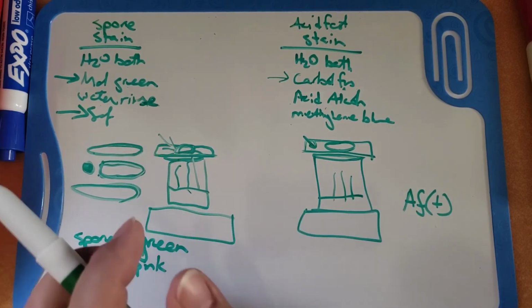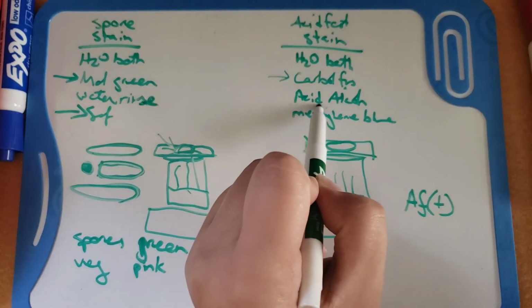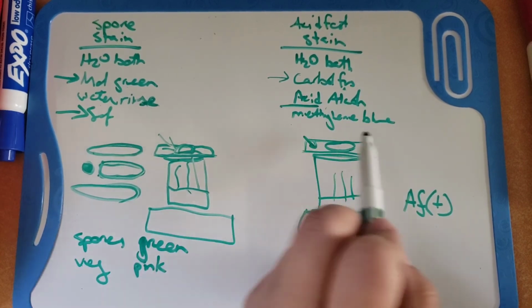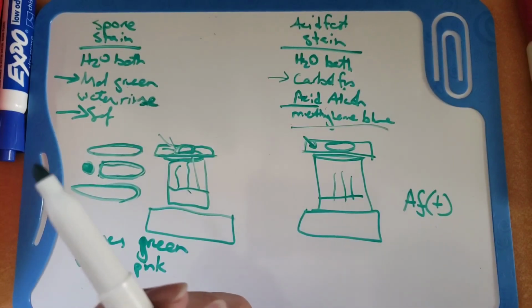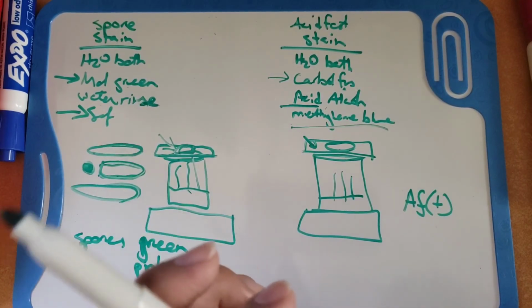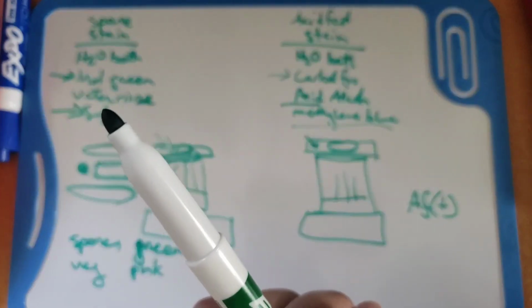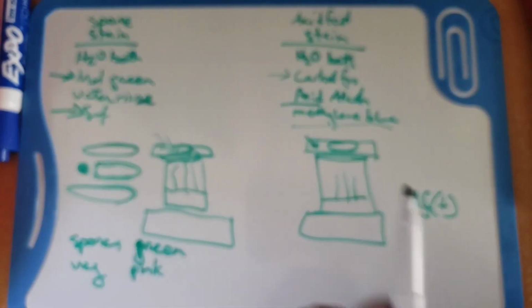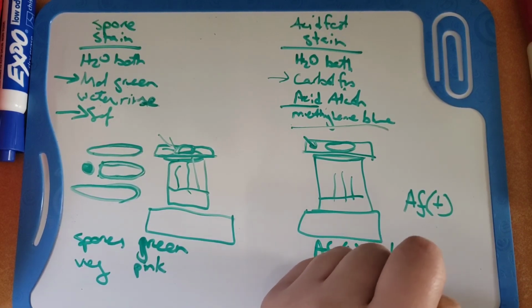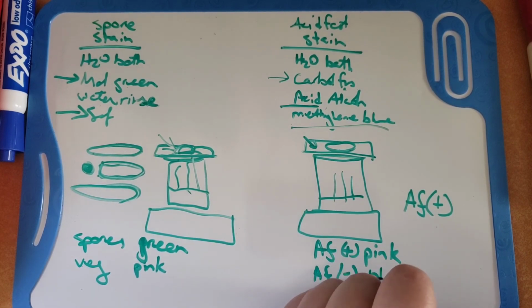When you have the gram stain, you use a regular alcohol rinse. This one is always acid alcohol, thus the name. So then afterwards, you will use methylene blue as a counterstain, and that will stain any bacteria that is not an acid fast bacterium. All right. So acid fast will always be pink. Acid fast negative will always be blue.